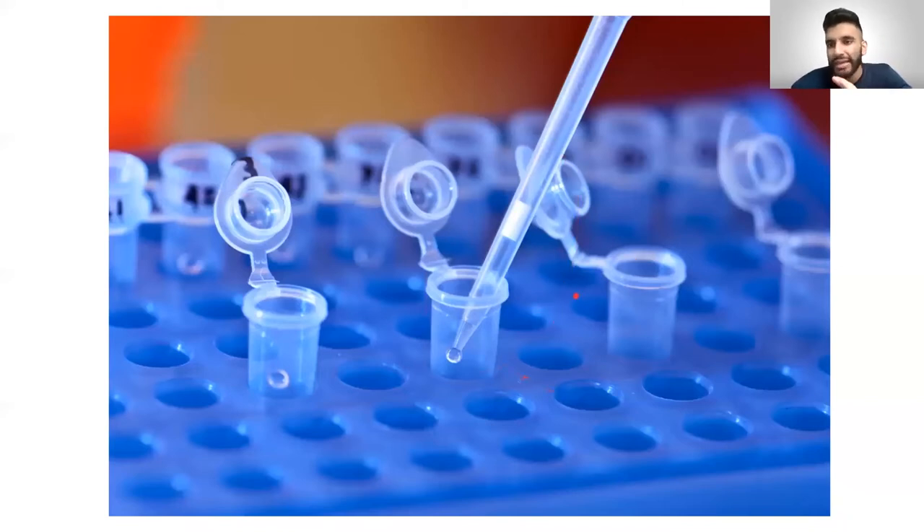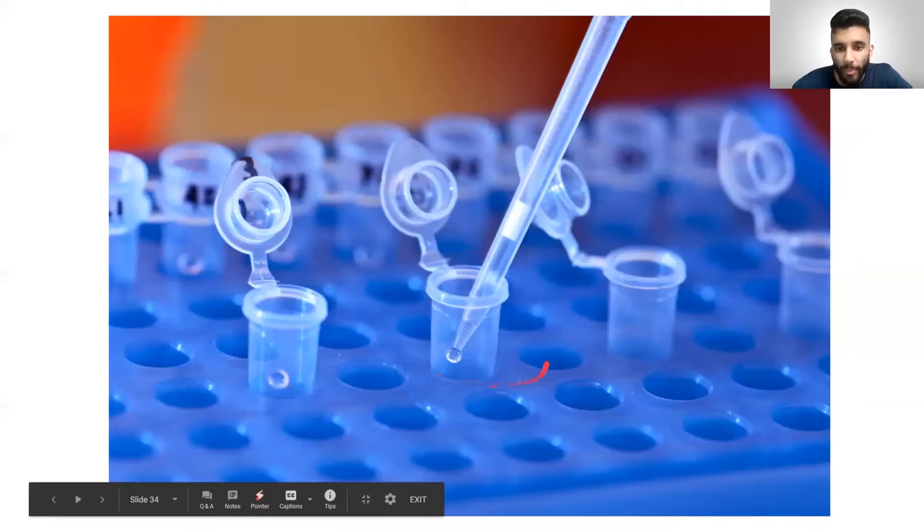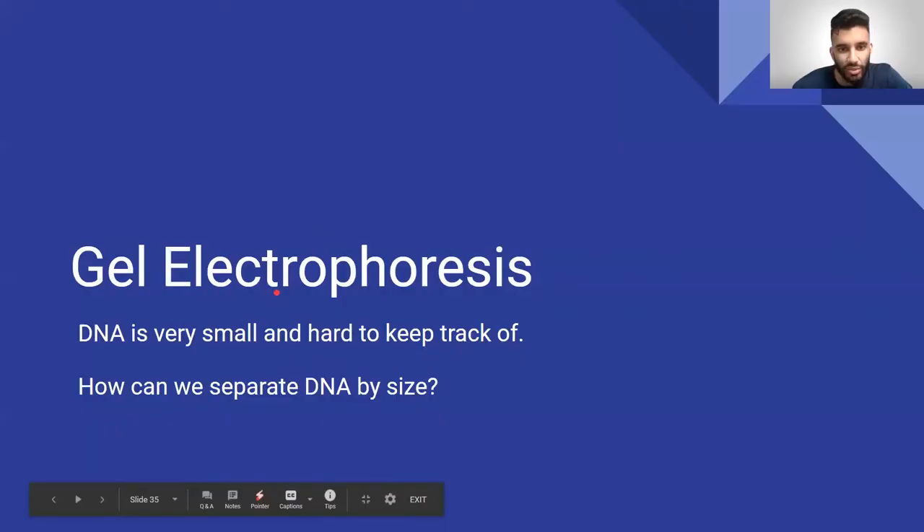So those are the fundamentals of lab work — using epitubes and pipettes. Epitubes are ways to store what you have, and pipettes are ways to transport what you have. Everything is just operating on a smaller, micro scale.